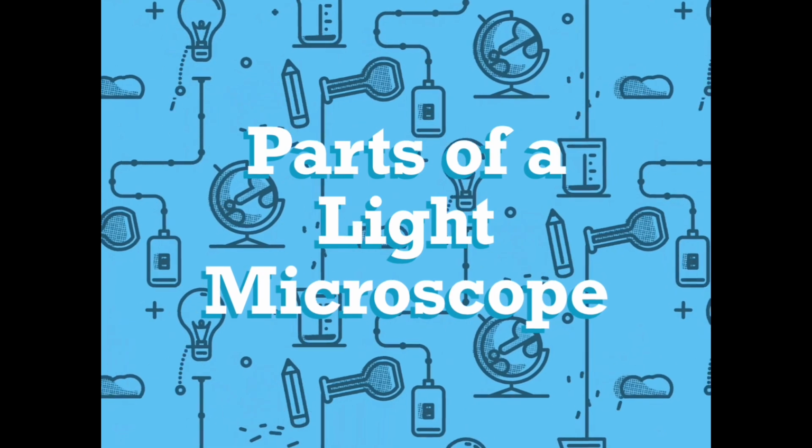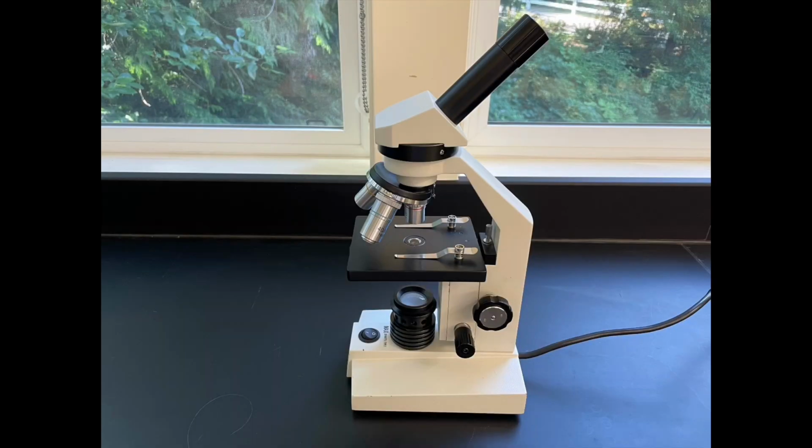Before you start using a light microscope to observe specimens, it is very useful to know the parts of the microscope. Let's start with the eyepiece.